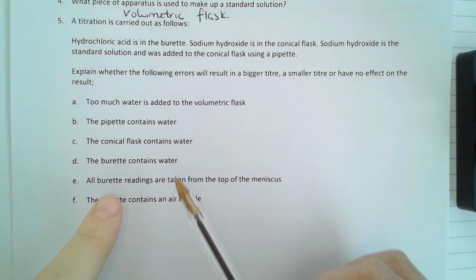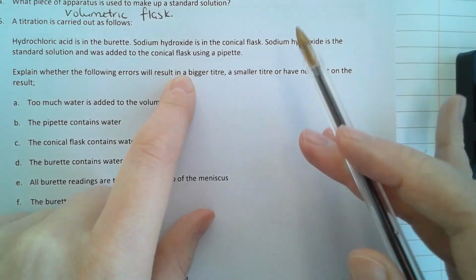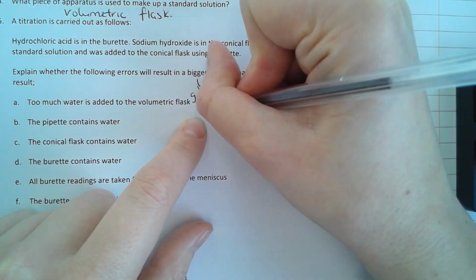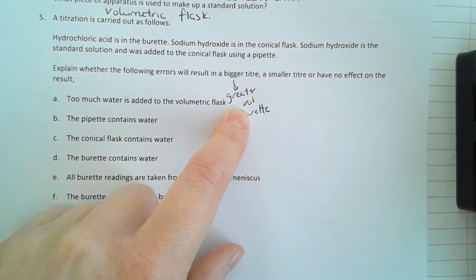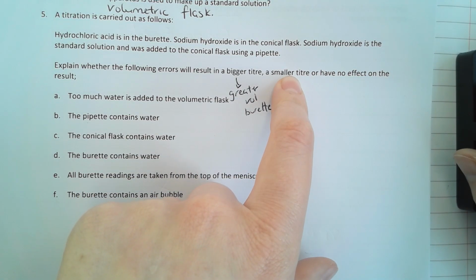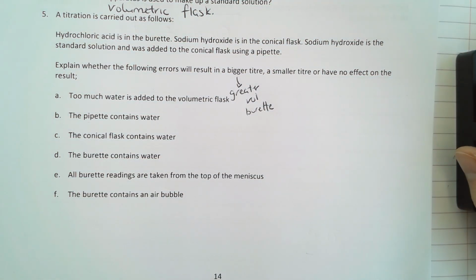And then we're going to look at these errors, and we're going to explain whether they'll give a bigger titer. Bigger titer means you need to add a greater volume from the burette than everyone else. So just say you guys are all doing it together and everyone had 25 centimeters cubed from the burette and you have to add 27 because you've made some sort of mistake. Smaller titer means you're adding less from the burette than everyone else to get that color change, and no effect, you're adding the same amount from the burette as everyone else. So we're going to go through some of these scenarios.